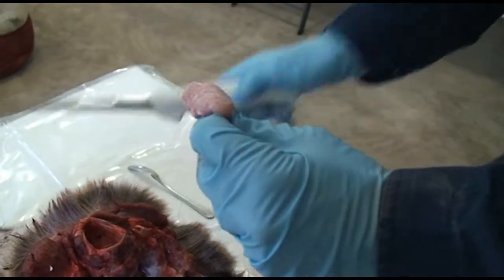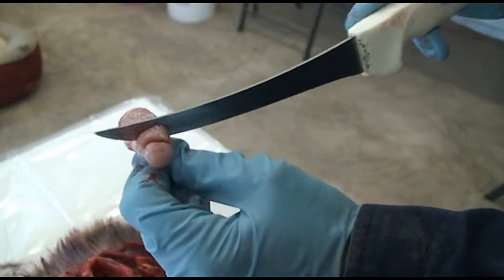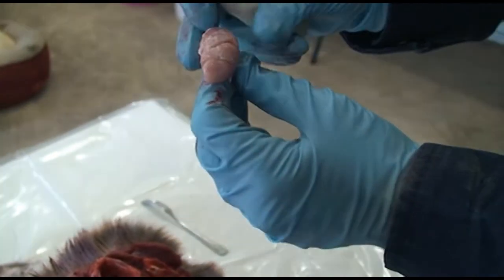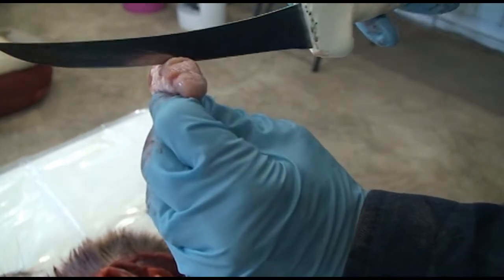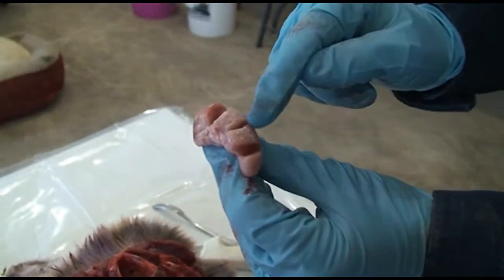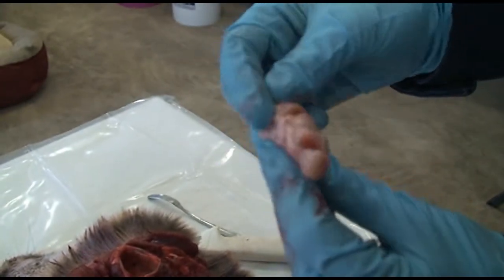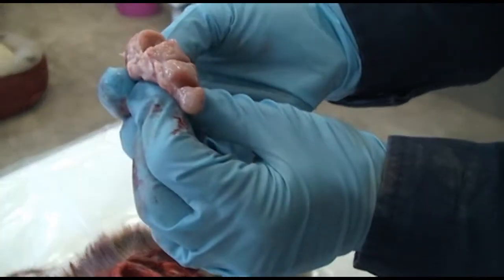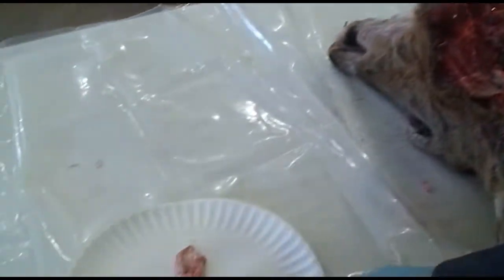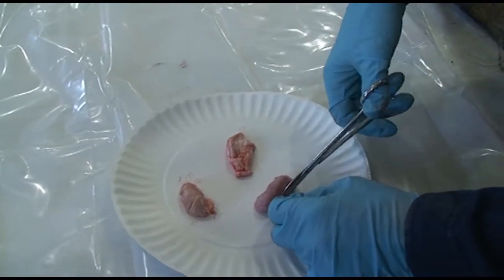And then we'll make some horizontal cuts halfway down, to make sure our formalin gets to the middle of the lymph node. And that gives us a good way also to take a look at the lymph node and make sure we don't have any abscesses or granulomas within it. So all three of our samples, our lymph node and our obex, will go in a formalin jar.